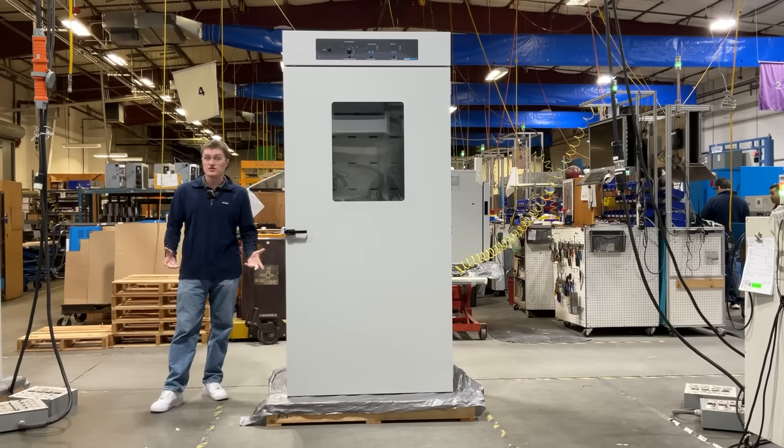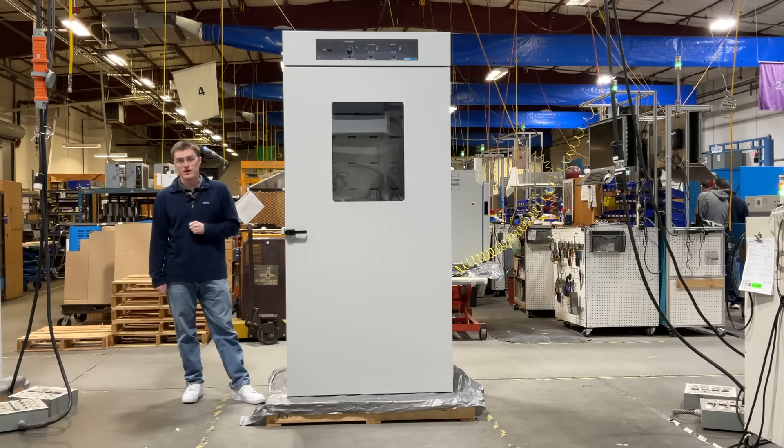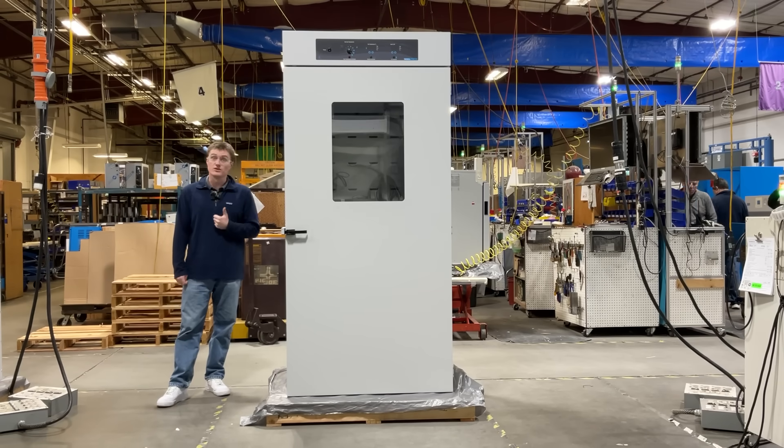This product features a spacious 40 cubic foot interior, accurate CO2 monitoring and adjustment, as well as precise, stable, and uniform temperature control. This product is ideal for applications including cell culture, microbiology, and research labs.